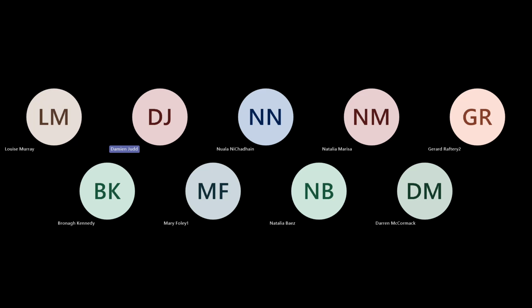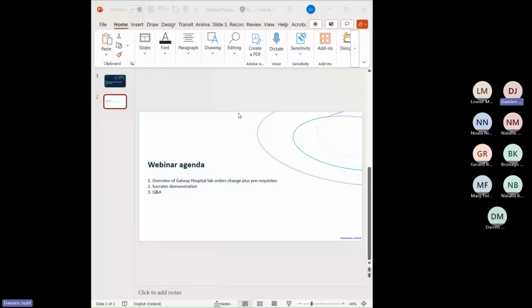Thanks so much for joining this webinar on the upcoming changes to lab orders in Galway. We'll be covering an overview of this change in Galway plus any prerequisites. We will then follow with a demonstration in Socrates and then close with a Q&A.